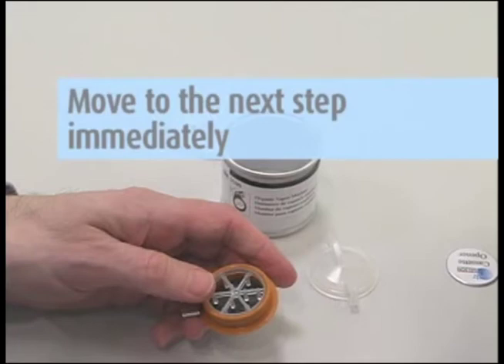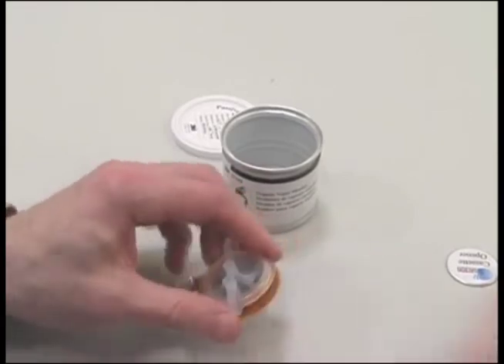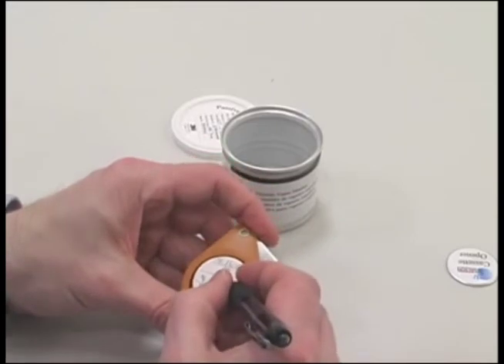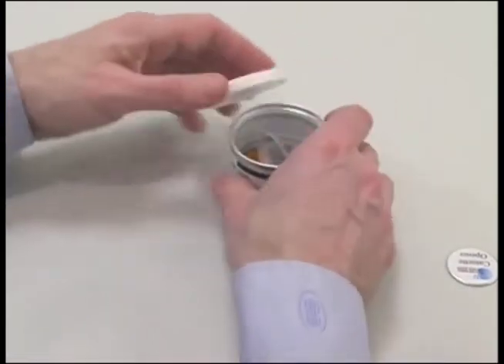Be sure to move to the next step immediately. When using the 3M Organic Vapor Monitor 3500, snap the elution cap with plugs onto the main monitor body. Be sure the two port plugs are pushed closed securely. Record the final sampling time on the back of the monitor. The OVM is now ready for shipment.